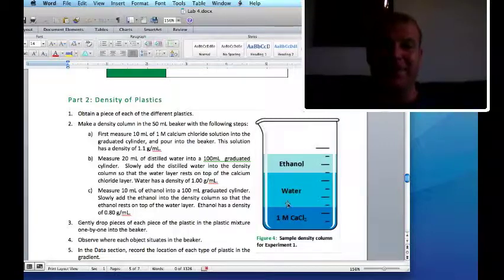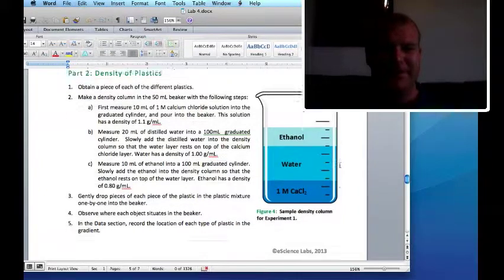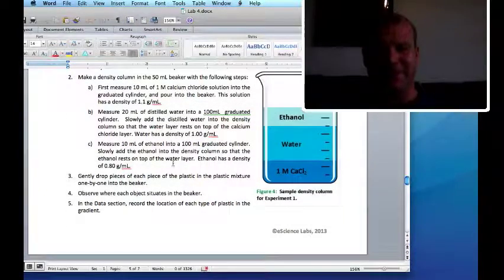And the ethanol is going to be denatured. So don't drink the ethanol, okay? Do not drink this stuff. I know that ethanol is the alcohol that's used in things like beer, but they are going to put a bitterant in it, which is going to taste terrible. And it might even make you throw up. So don't drink the ethanol. Ugh. Anyways, now that you've had that public service announcement, put the pieces of plastic on there.